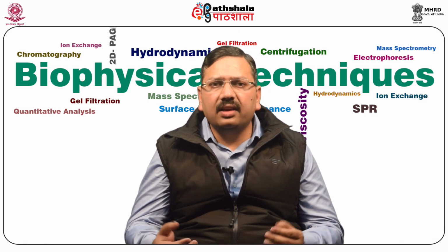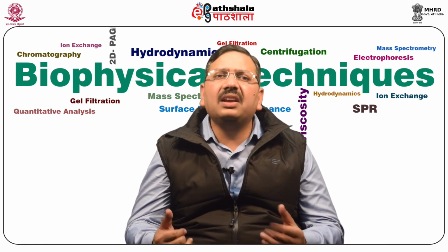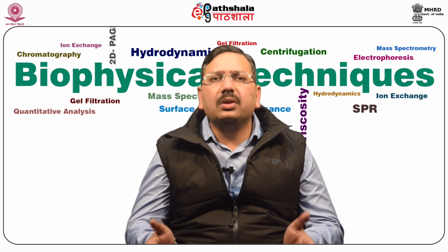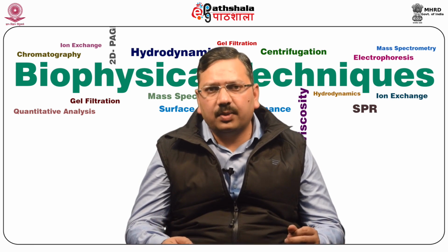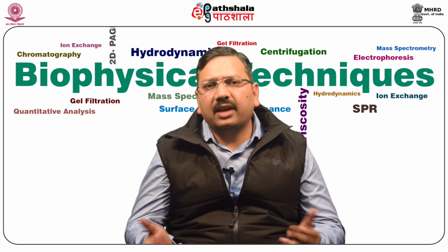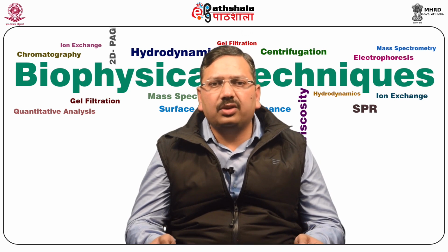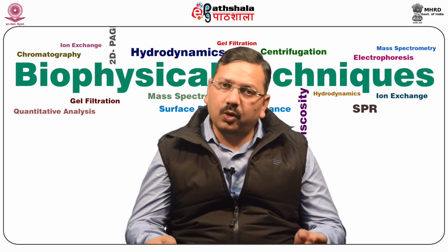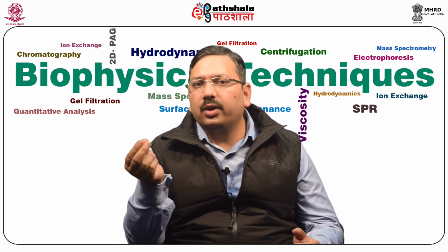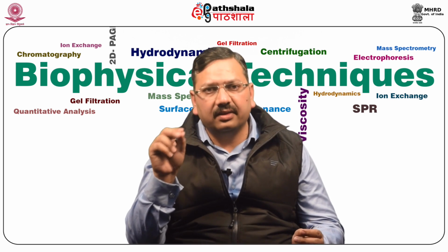Moreover, unlike ESI, MALDI generates spectra that have just a singly charged ion form, and it is easier to reach the identification from this MALDI experiment. It generally happens in positive mode as M plus H plus ions. This is a more robust machine as compared to ESI, and because of this it tolerates salt and non-volatile components. If this happens in ESI, you will never get the results.